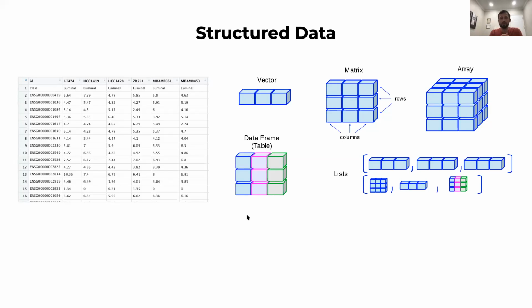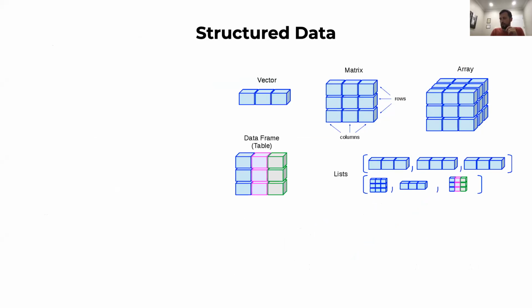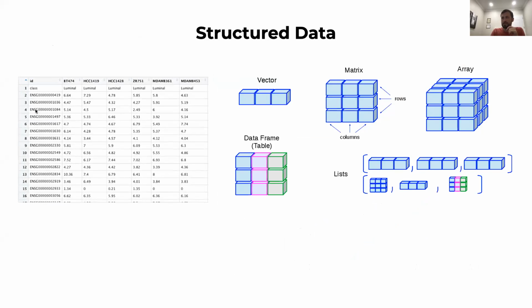Okay, so let's remember these definitions as we go into today's practical part of the session. And for Prerna, who was asking to repeat about factors: in this data frame or in this table, we have names of genes, we have names of our samples, but the samples fall into specific categories.